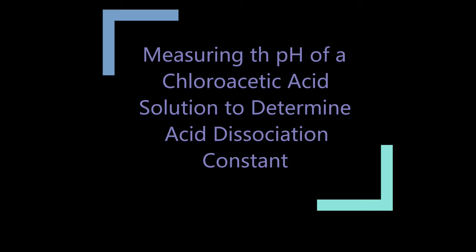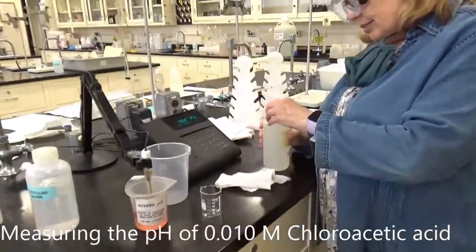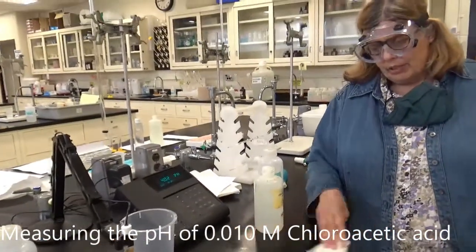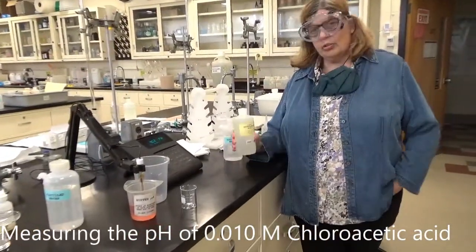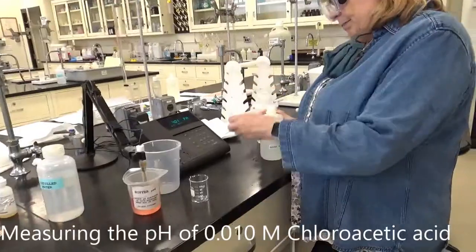The final job we have in this lab is to measure the pH of a 0.01 molar solution of chloroacetic acid. And in doing so, we will be able to find the data we need to determine the Ka for this acid. So there's only one thing more that we have to do in this experiment. And this is really unrelated, honestly, to what we've just done. But what we're going to do is figure out the equilibrium constant for chloroacetic acid by taking a single measurement of its pH. Not the best method to do it, but that's what we're going to do.